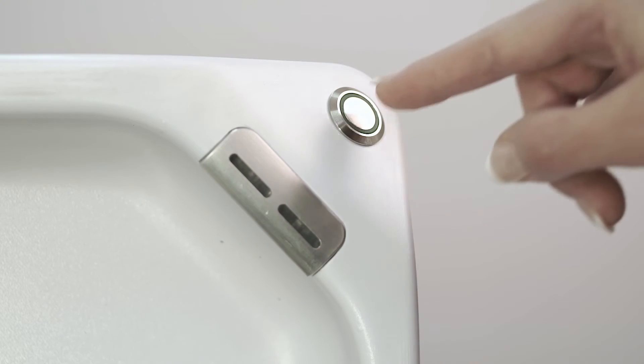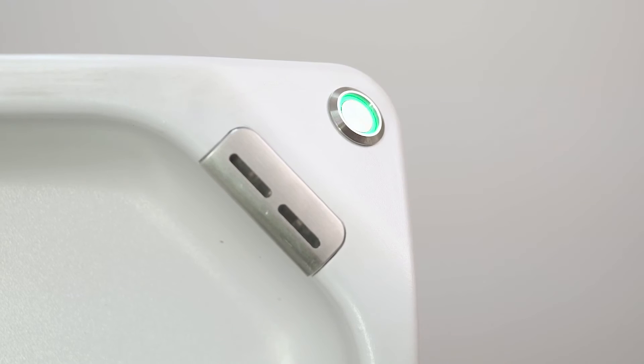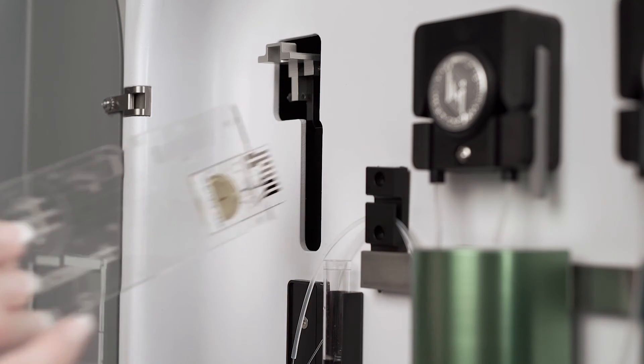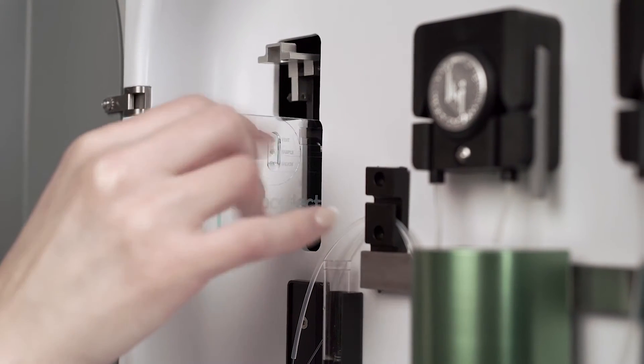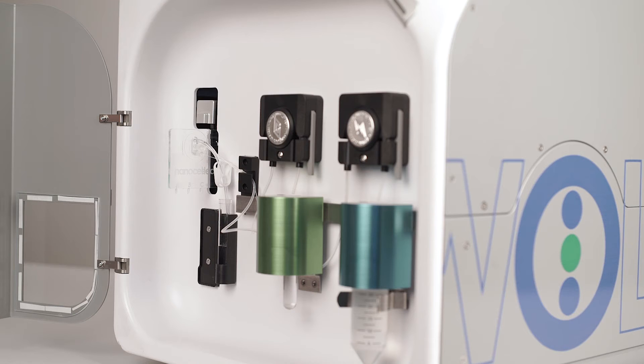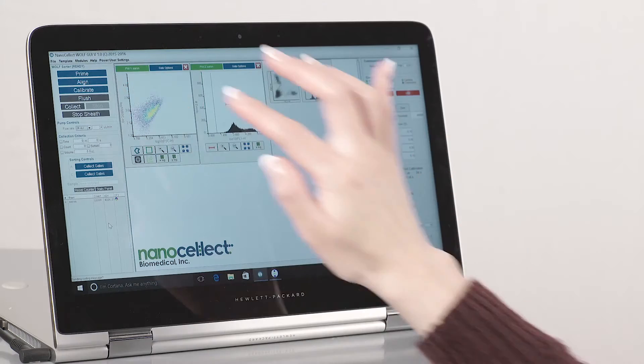The steps to get going and actually sort your cells is very easy and takes only a few minutes. You start by plugging in the cartridge. You do a priming step which only takes a couple of minutes.